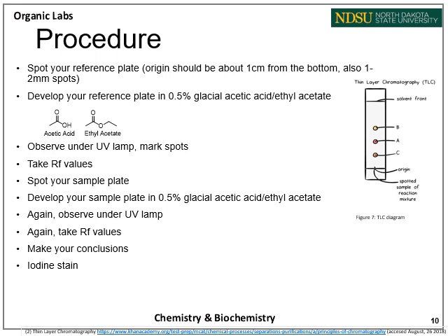After you develop your slide, make sure you mark your solvent front. That's very important, or else you won't be able to calculate your RF value. After you've let the slide dry, you're going to observe it under the UV lamp. Make sure you mark the spots after you're done observing it, because once you remove it from the UV lamp, it will disappear. Next, take the RF values. You're going to want to illustrate your TLC slide in your lab books with all the RF values.